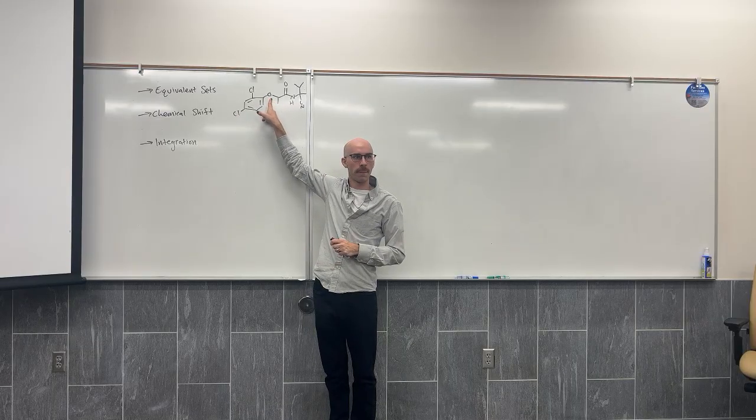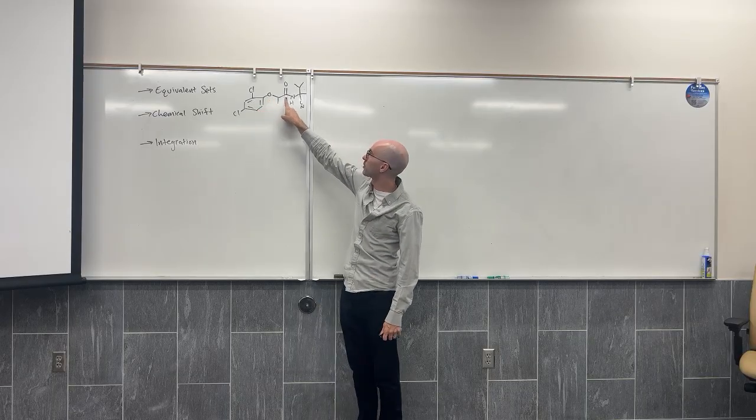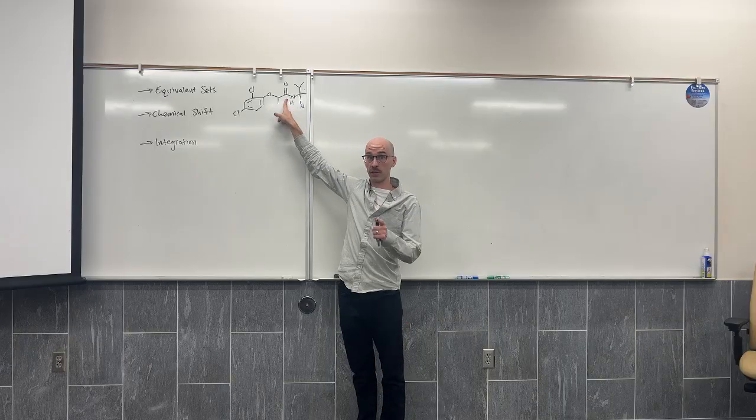Functional group? Ether, because there's carbon on either side. And you could say it's part aryl ether because on one side is an aromatic ring. But ether for sure. What about this carbonyl group? You remember the carbonyl? Can someone tell me what carbonyl means?